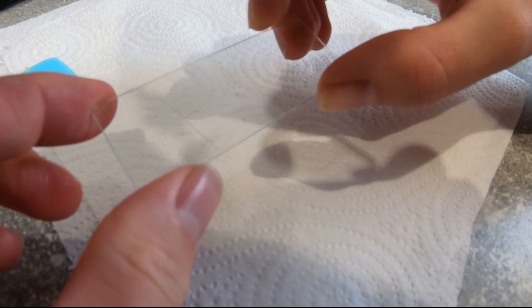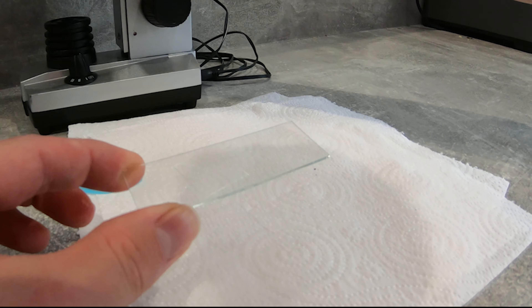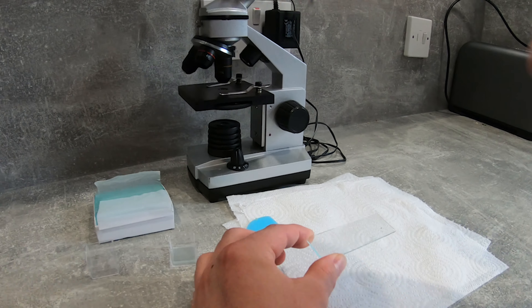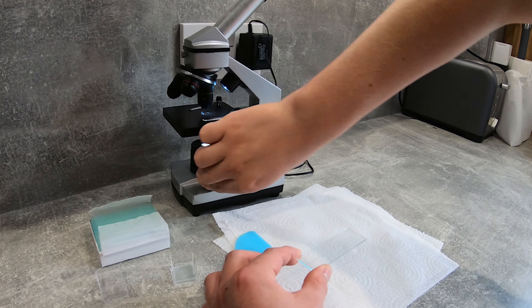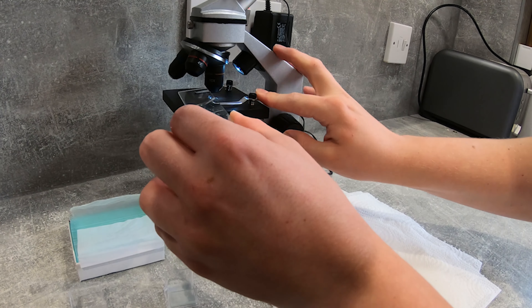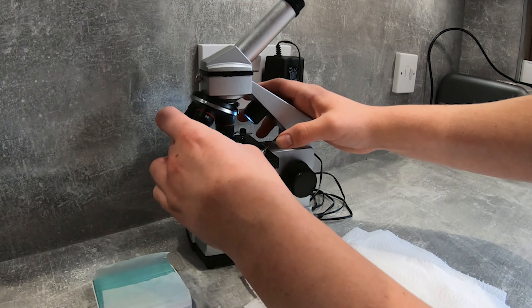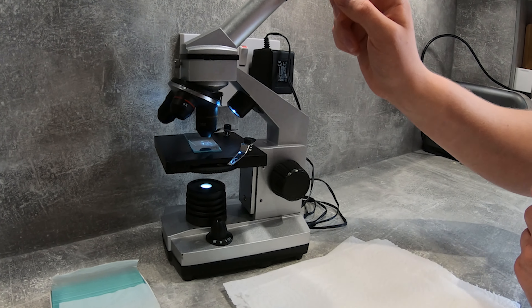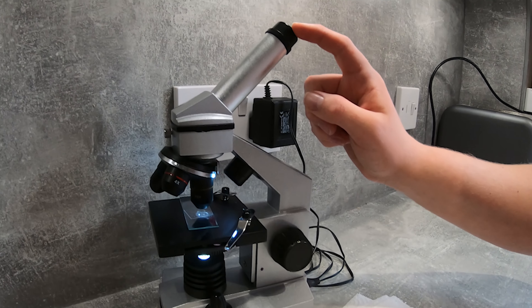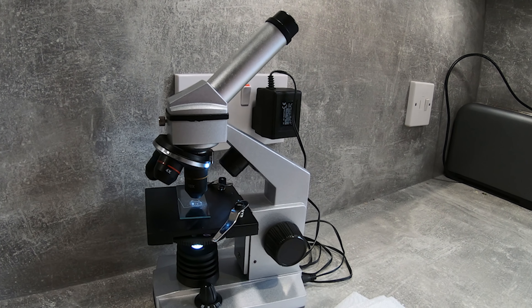We're going to place the cover slip onto the glass slide, then take it to the microscope, turn on the light source, and place the slide onto the stage. Then we'll look down the magnifying lens and see what we've found.